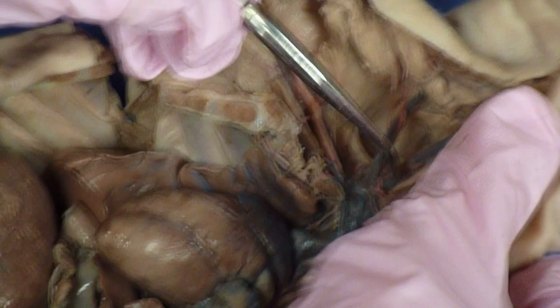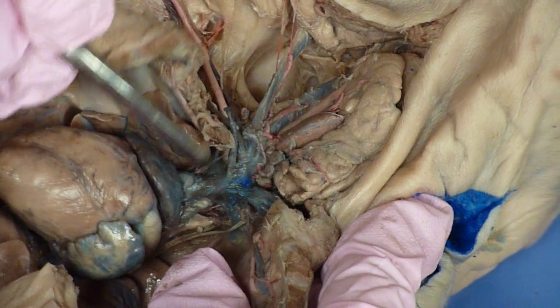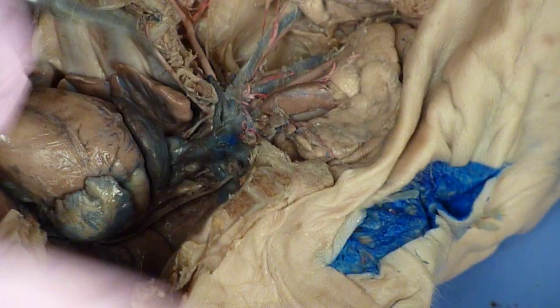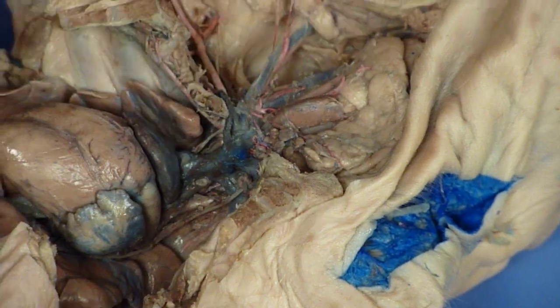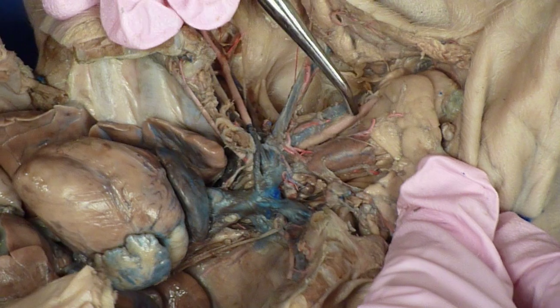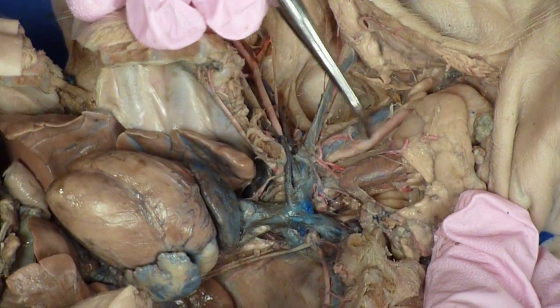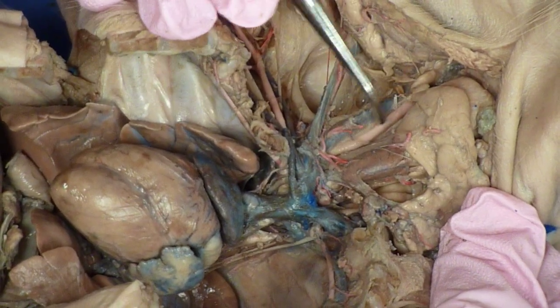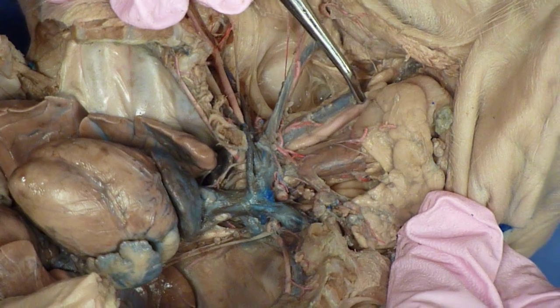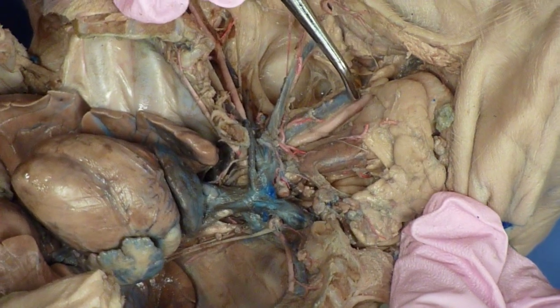If you follow the other branches off the brachiocephalic trunk and go up under, that branches into your left and right carotid. So here's your right carotid artery, right here — this pink one. And that's all your arteries above the heart that you guys have to know.